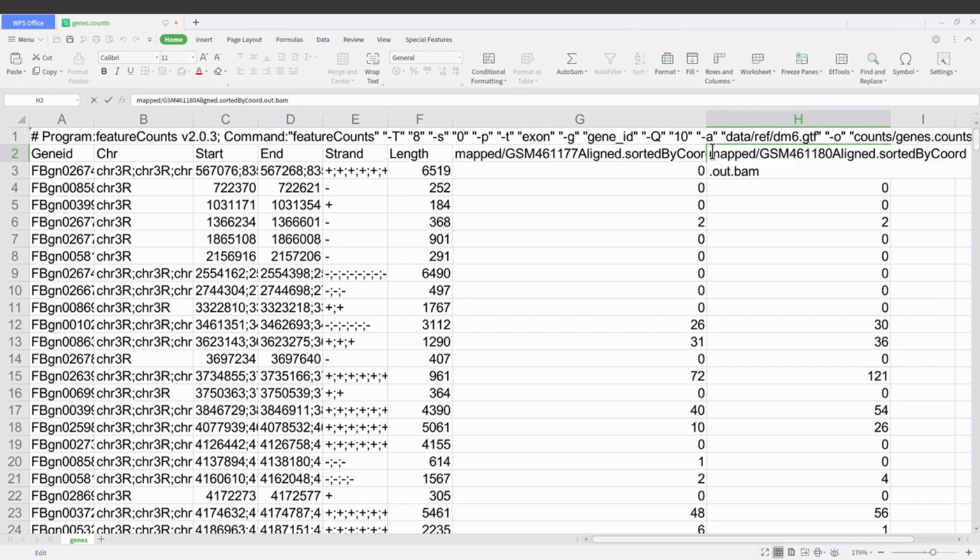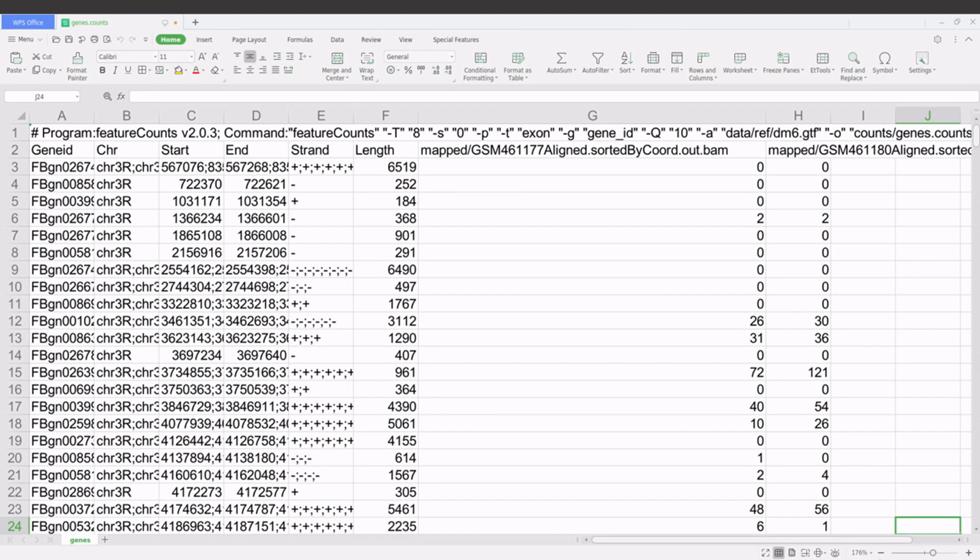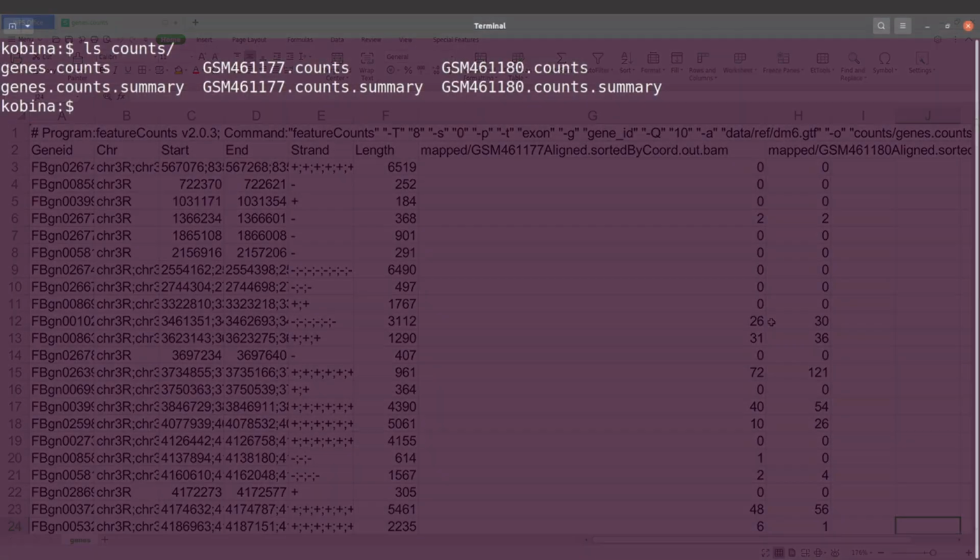This name here, we can clean it and make it better, because ideally what we want is to use this ID here. That's what we want to use. And so you can write a bash script or Python script or R script to extract the information and properly format whatever is here. I already have a script that I use to process files like this, so I'll show you how that script is used.